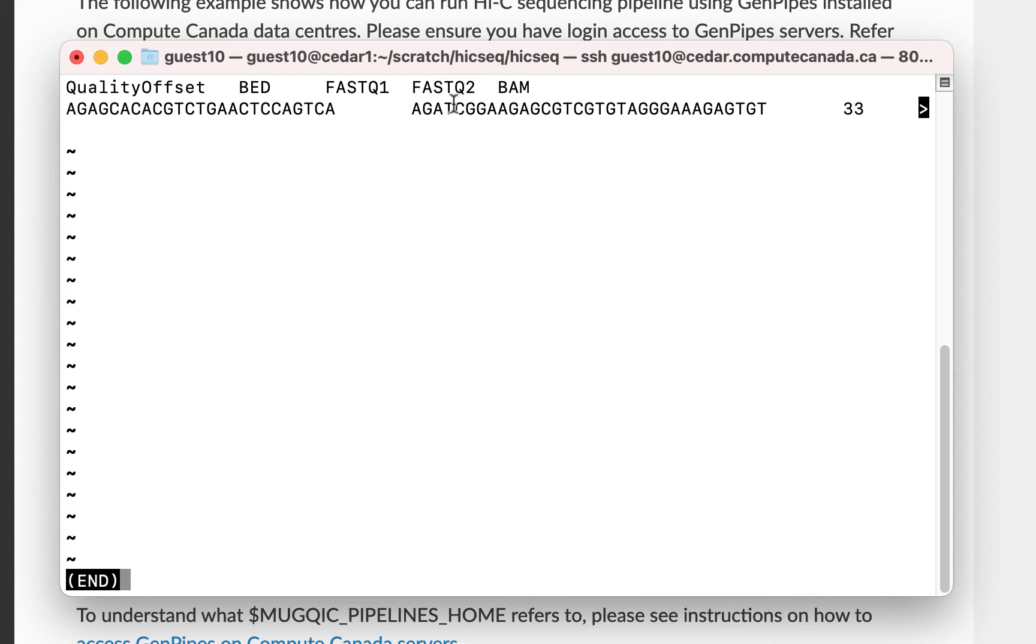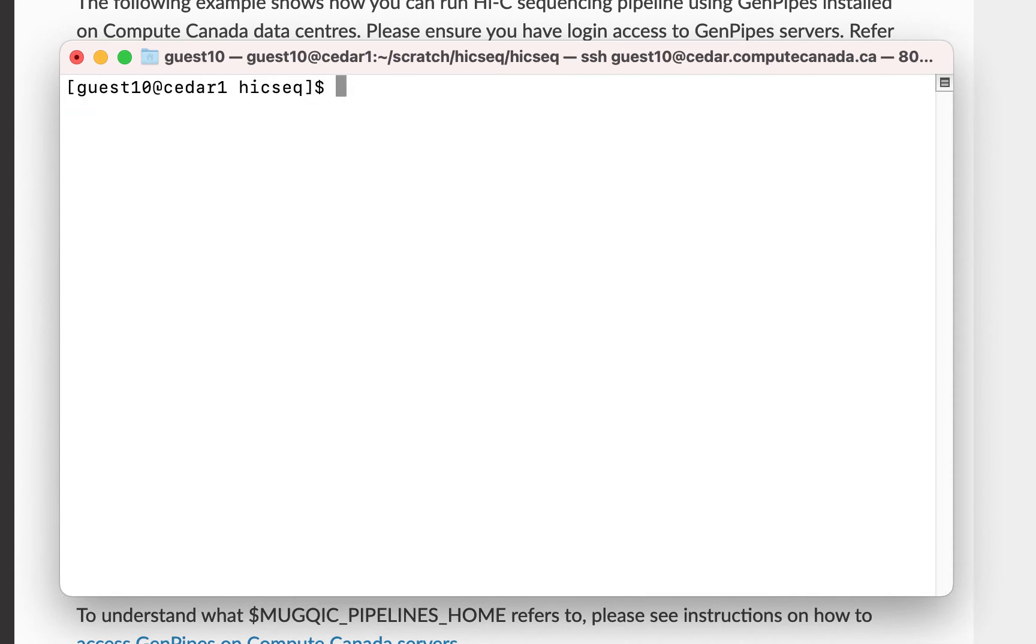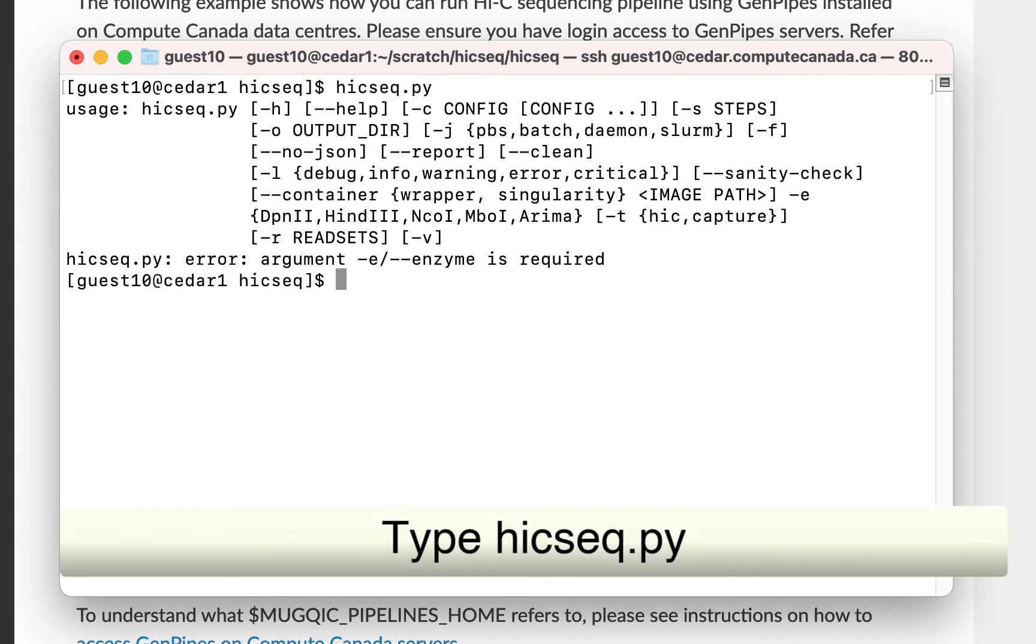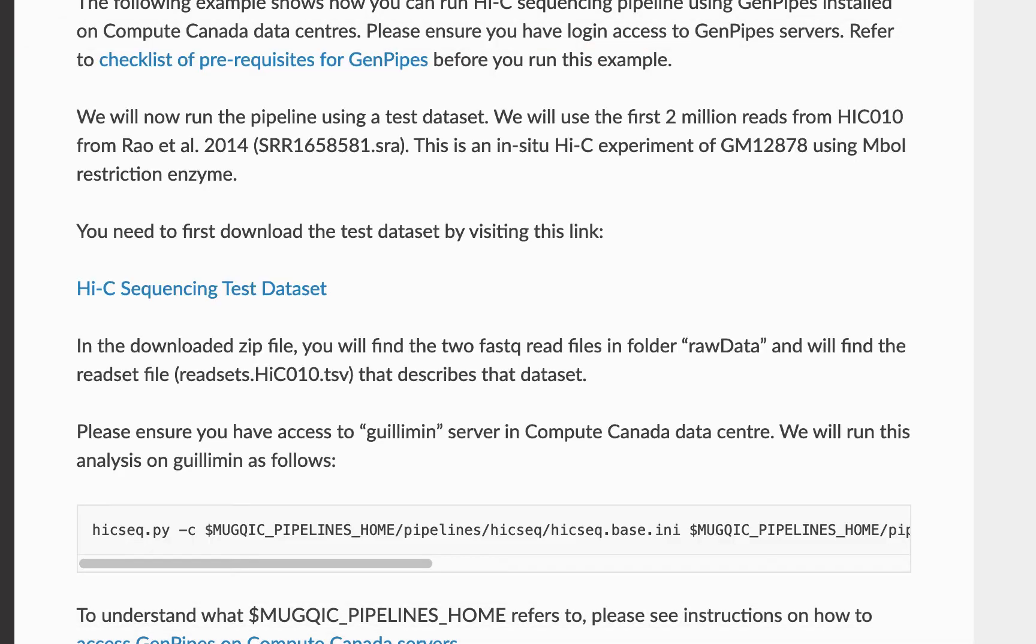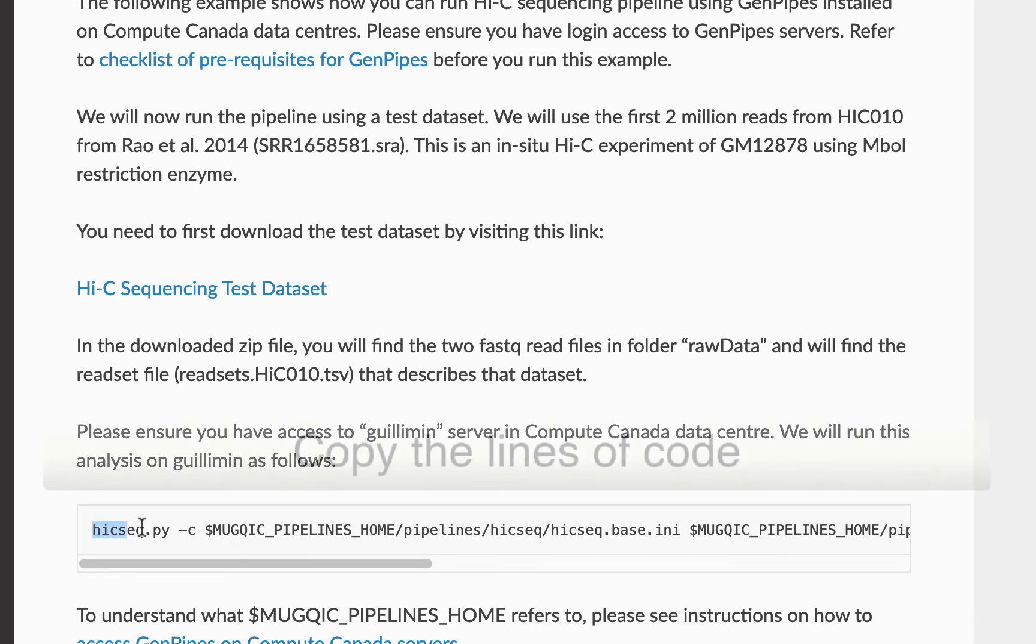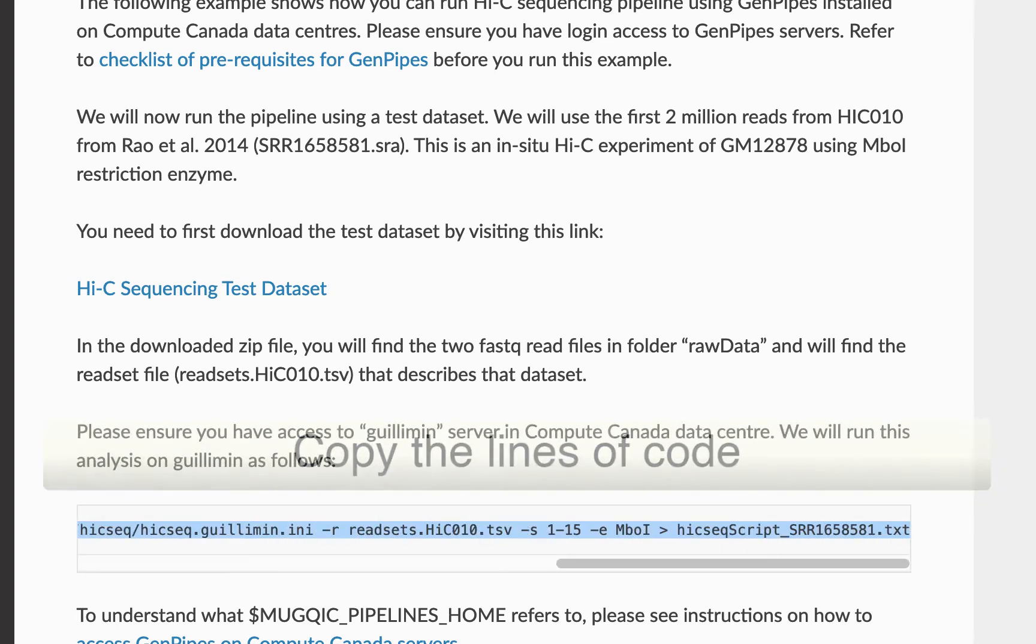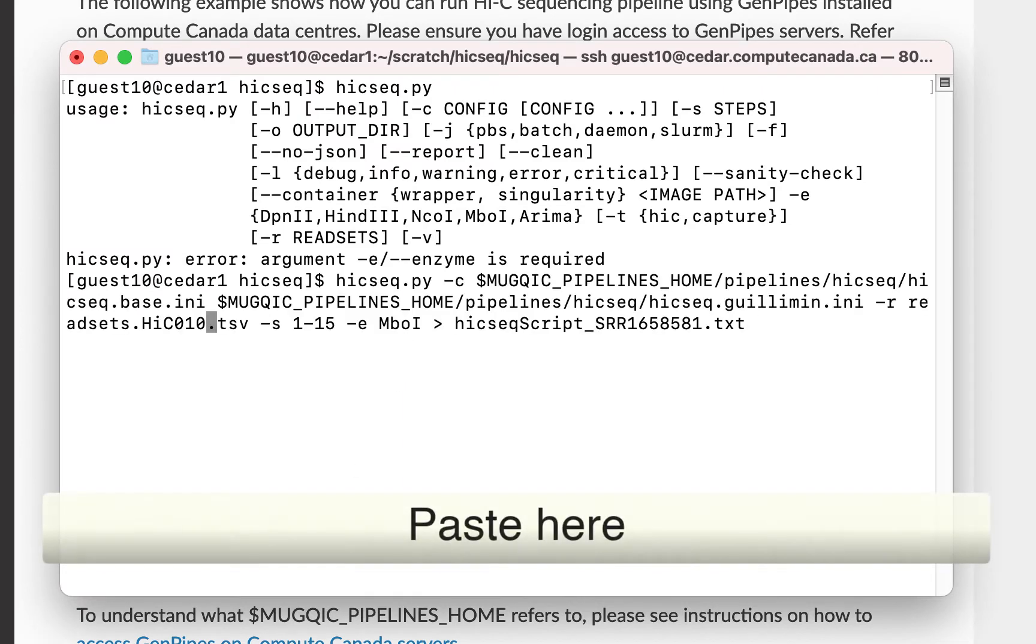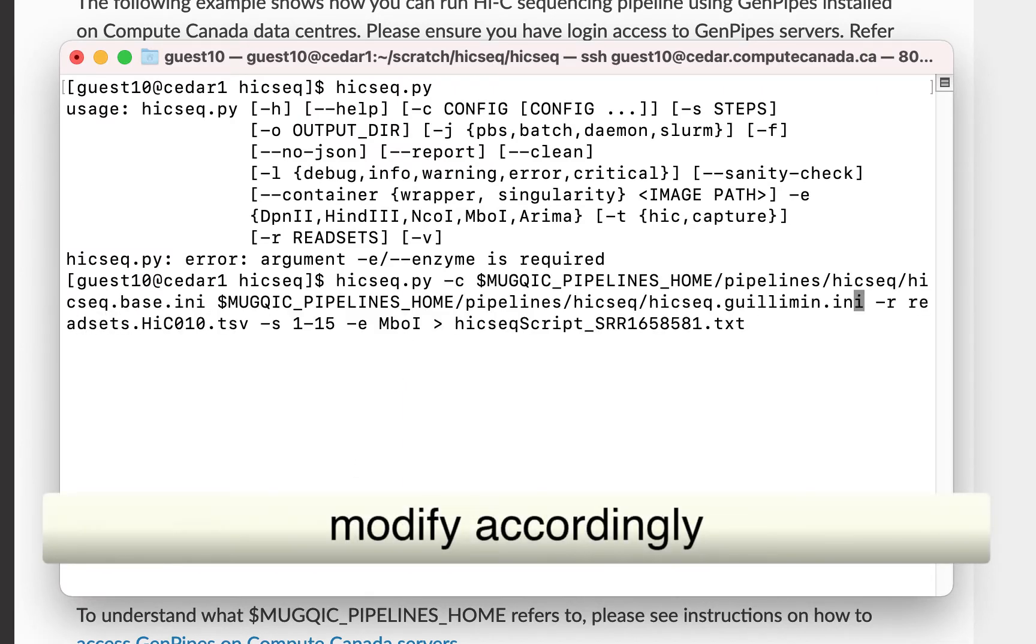You can either specify BAM or FASTQ files in the readset file. Each column is identified by its name, so make sure to follow the same column names as in our sample readset file. Let's run the pipeline now. Type hicseq.py and press Enter. You can see the full argument list that is required to run the pipeline. Go to the documentation and copy this line of code.